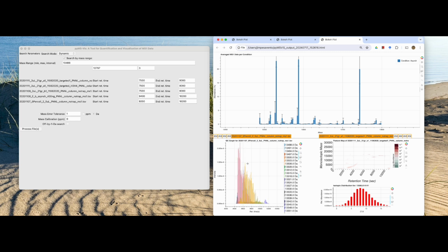Again, this tool was developed primarily to quantify proteoforms that have been extensively characterized, so you're quite sure what the masses are, and you want to relatively quickly get at histogram profiles showing similarities or differences between different runs, for different masses that were already extensively characterized.